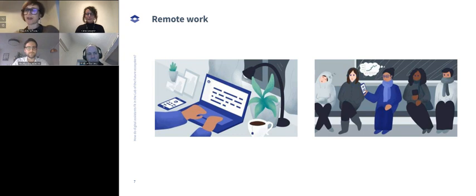We have seen already users in a lab being able to take notes on the go when they're commuting in traffic and they are already thinking before getting to the lab what they're going to start to do. They would actually like to be able to just control and start certain equipment that takes a while to get started once they get in the lab. So planning on the work they're going to be doing that day before they get to the lab, real-time data exchange, especially during COVID when not everyone can be present in a lab, so leveraging for that, receiving notifications on their mobile and status of different experiments and work being done in a lab. We've seen a lot of that.